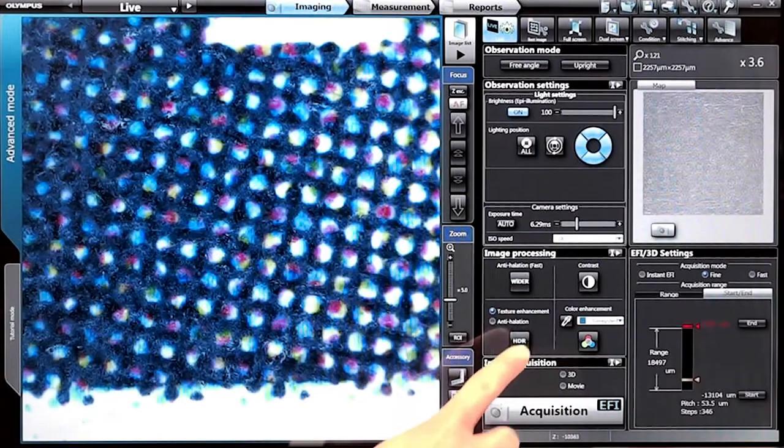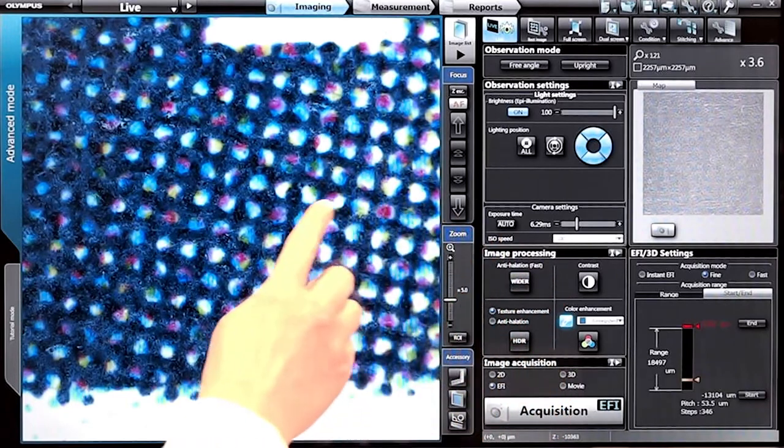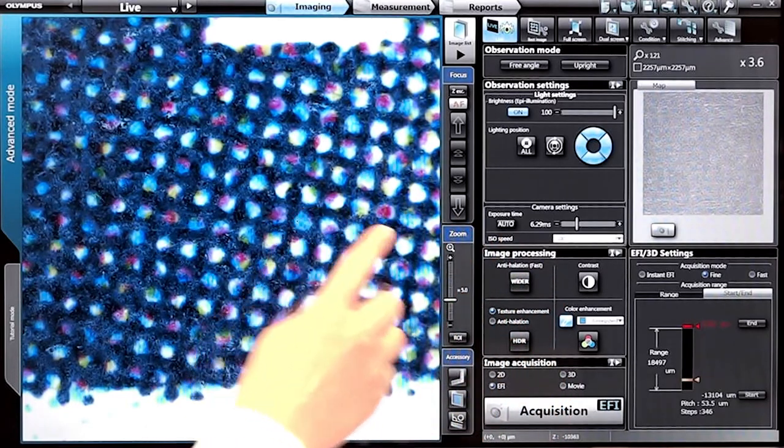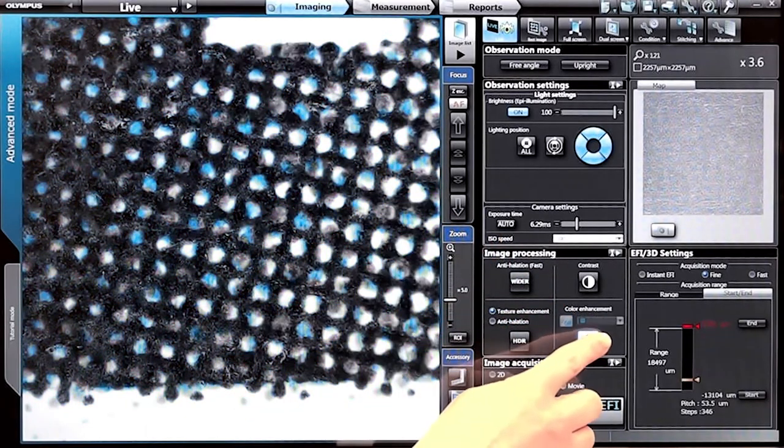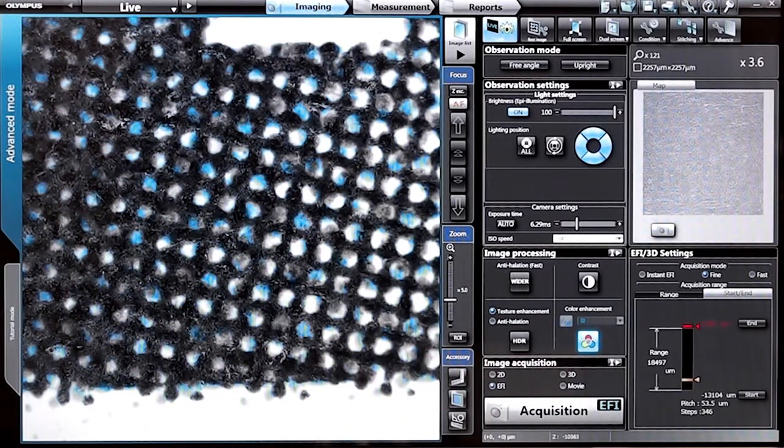And color enhancement lets you highlight what you want to see in brilliant color while the rest of your image stays black and white for easier inspection. All these features are available at the touch of a finger.